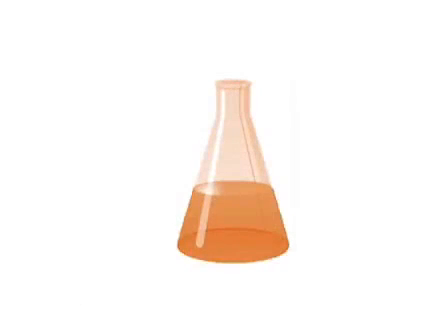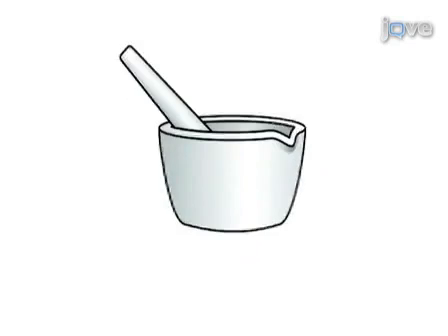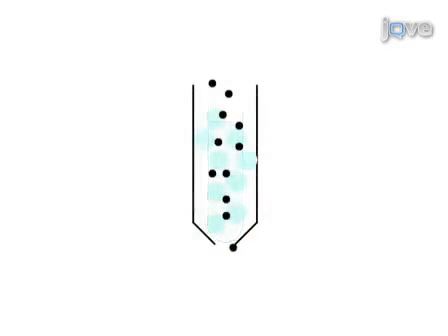This procedure begins with culturing the bait strain in media containing normal amino acids and the SILAC control strain in heavy isotopic lysine and arginine. Equal amounts of both strains are mixed and lysed by grinding in liquid nitrogen. Crude lysate is first pelleted by centrifuge and then cleared by binding to Sepharose beads.